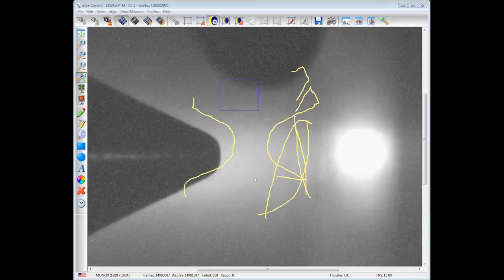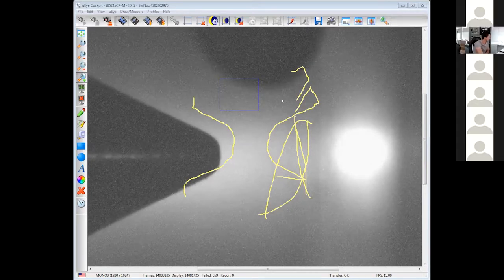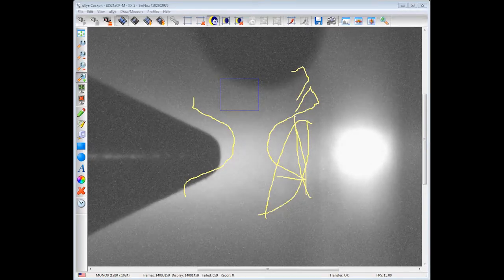I guess now I can show you another screen where you see the camera which now looks inside the cell. There is a camera, there is one window from the side, and through this window you can look inside the cell. So this is the enlarged picture of the nozzle, which is connected to the front part of the cell. There is the engine, there is the motor, turbo start. Stop motor, okay.